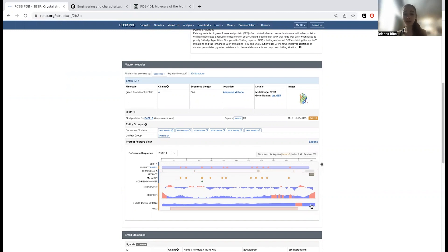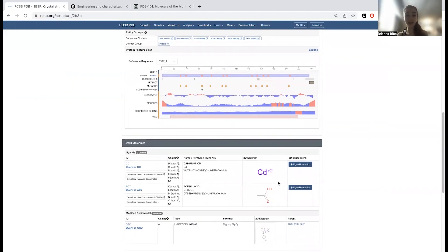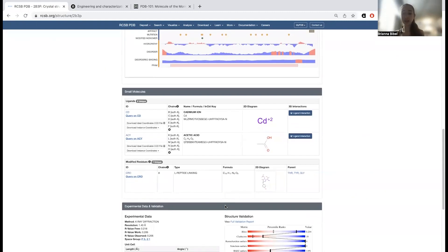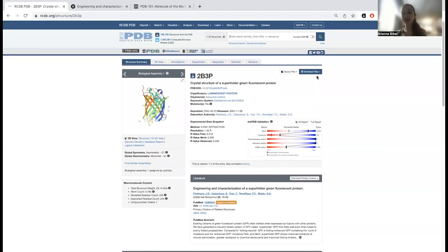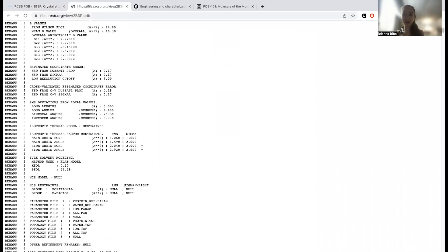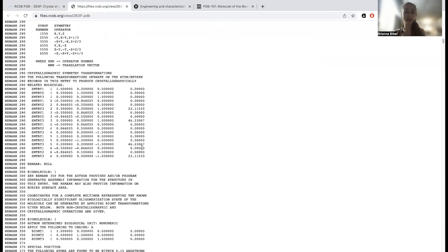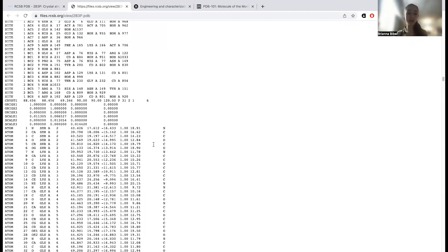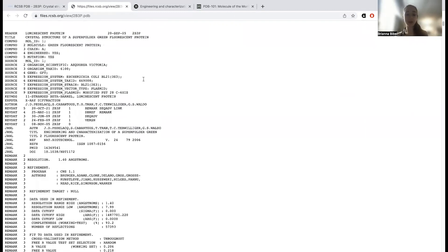The structure is crystallized in partnership with acetic acid and cadmium, which we'll remove when we go in to make it easier to see things. There's also the CRO — the chromophore at the center. Looking at the PDB file itself, you can see columns corresponding to the location of atoms and different features. One of these columns is the B-factor, also called the temperature factor or displacement factor. A higher B-factor means we are less confident about the location of those atoms.